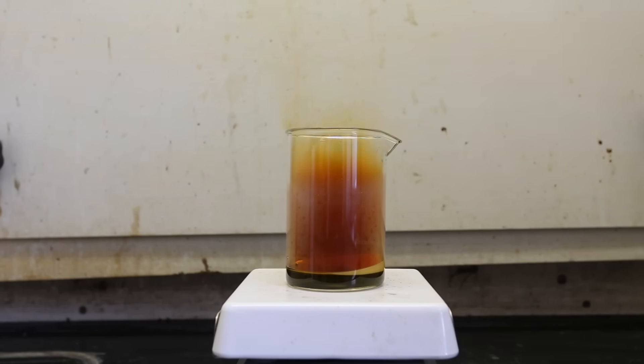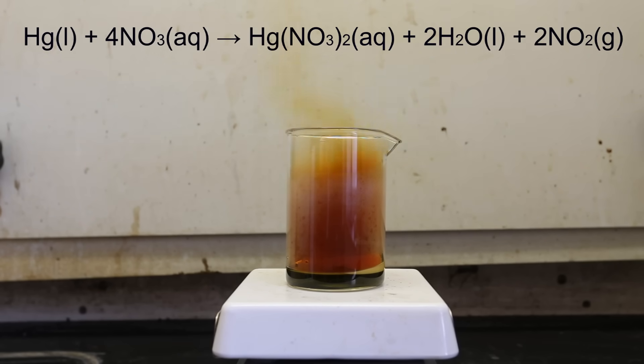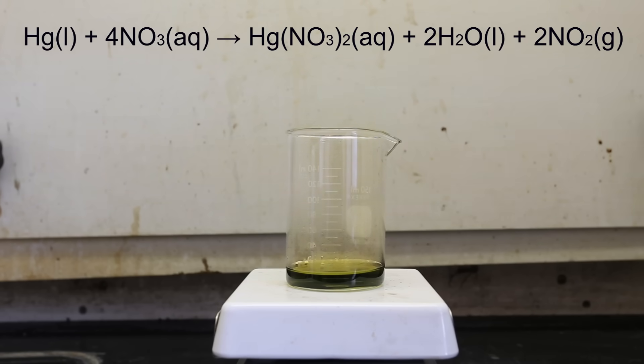Dark red nitrogen fumes are released from the solution, and the solution begins to get darker and darker. The water-insoluble elemental mercury reacts to form water-soluble mercury nitrate. It is extremely important to note that the mercury nitrate required for this reaction is mercury(II) nitrate, which will only form in concentrated nitric acid. If elemental mercury is reacted with dilute nitric acid, it instead forms mercury(I) nitrate. The major nitrogen gas evolved in this reaction is nitrogen dioxide, which is quite toxic, so it is extremely important to do this reaction in a fume hood or outside.